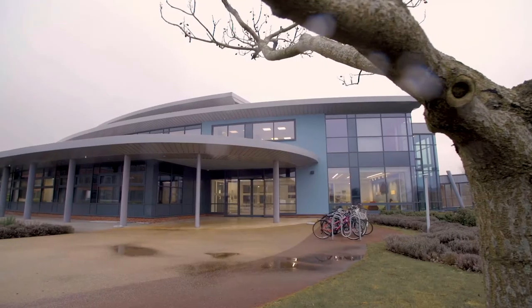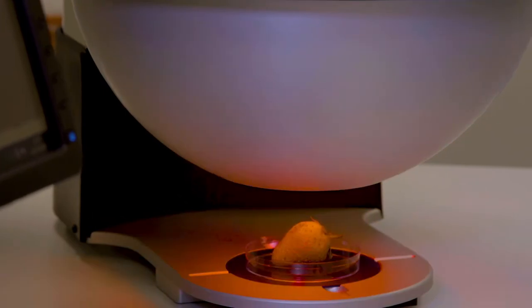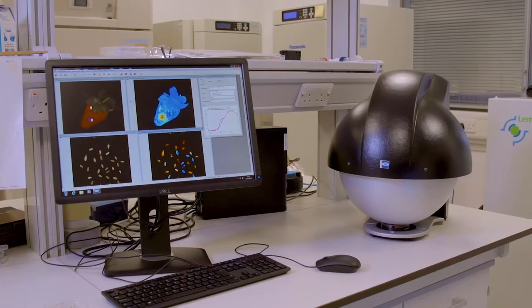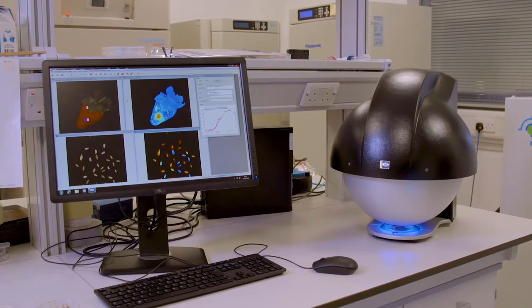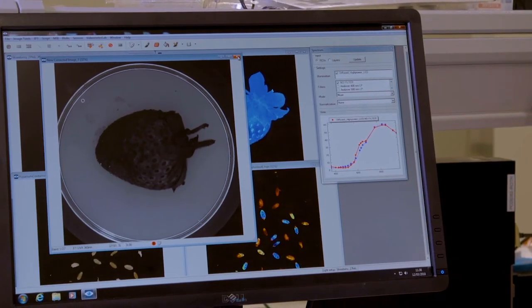Welcome to the Fine Phenotyping Lab. In plain English, what we do here is use some very nice imaging equipment to automate the detection of pathogens and pests, and the scoring of plant responses to them.